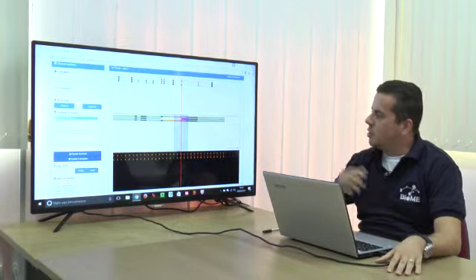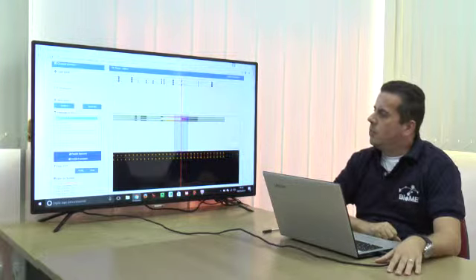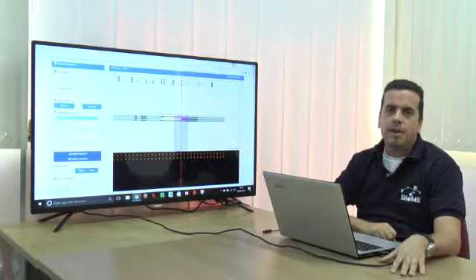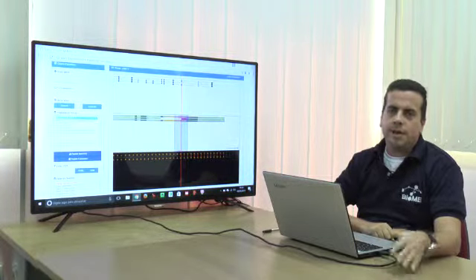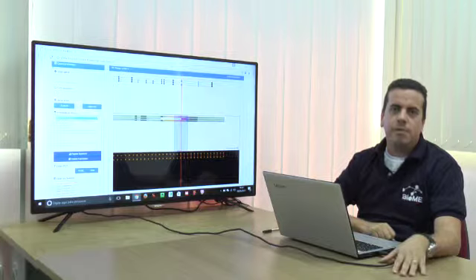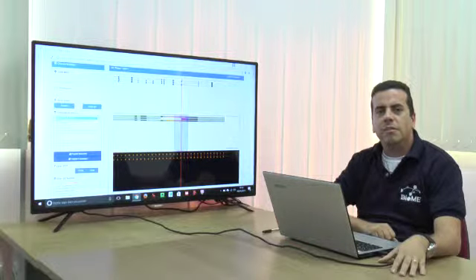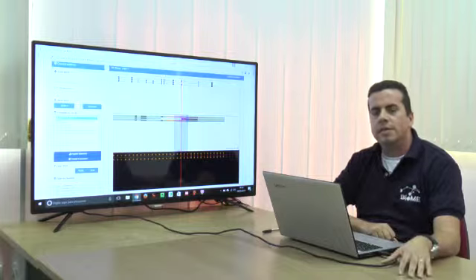The other part, of course, is what you see here, a web browser interface, where you can be a proteogenomics researcher and use this to validate your data and even to report your data. Or, on a more broad audience, you could be a biochemist or a geneticist interested in a peptide of relevance. You can access our viewer on the web address that is going to be available in the publication, and you can see the identifications that we did in our own analysis for the publication.